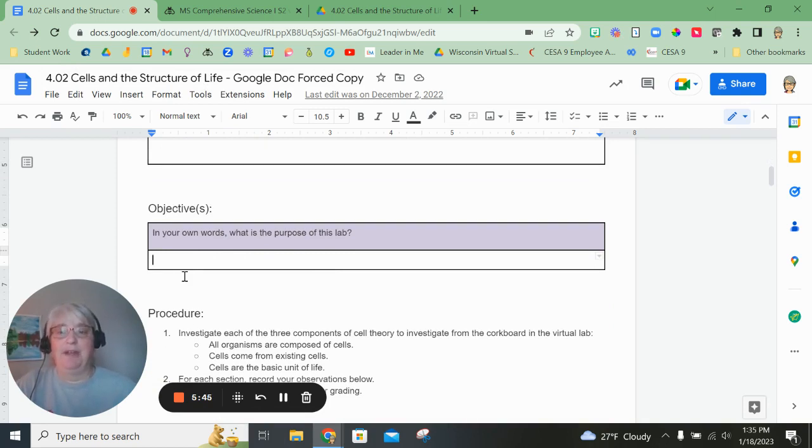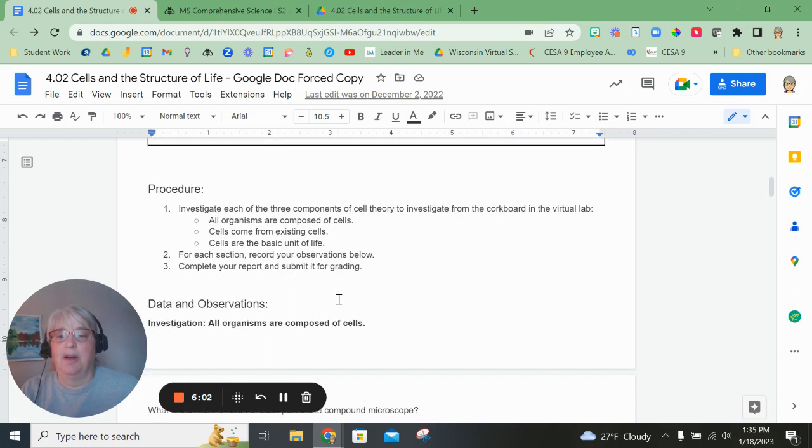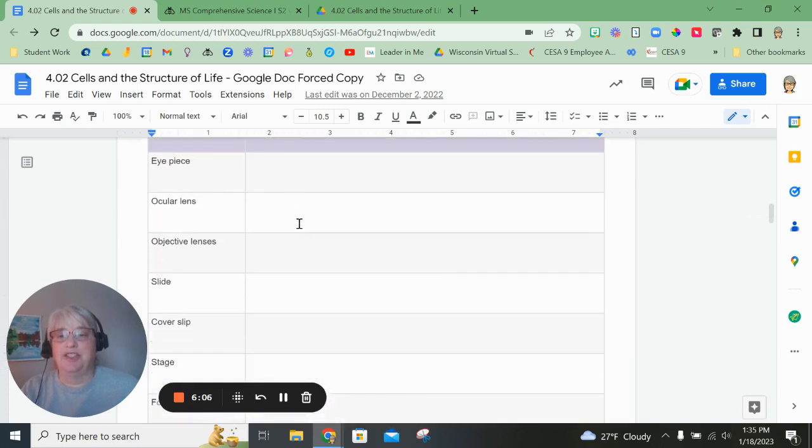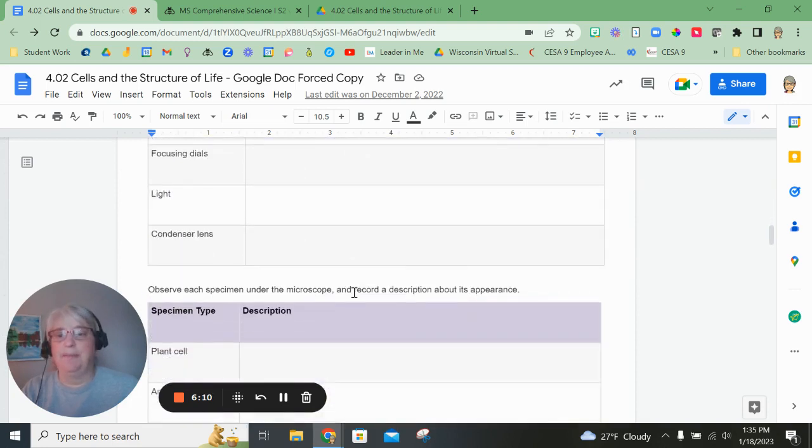If you can't figure out why we're doing it at the beginning, then wait until you're done and see what kinds of things they asked me about. What kind of questions did I have to answer? That's telling you that that's the objective. That's what the lab is there for you to learn. All right. Then here, you're going to list the function of all those different parts of the compound microscope. Remember, I told you to read them.